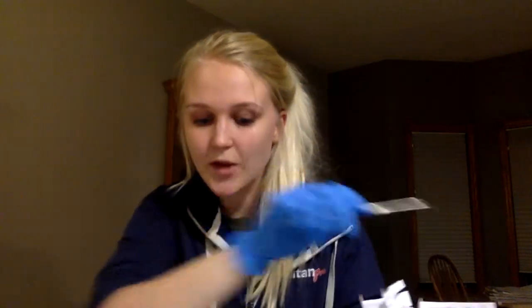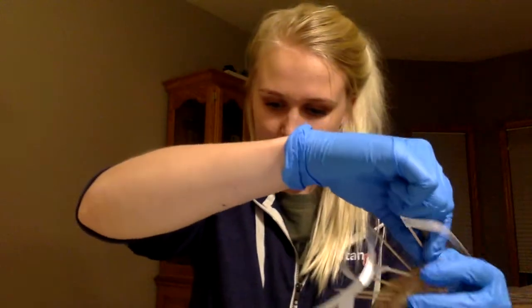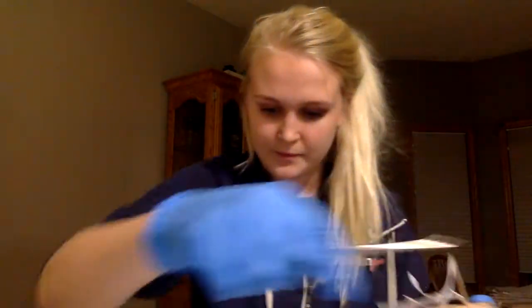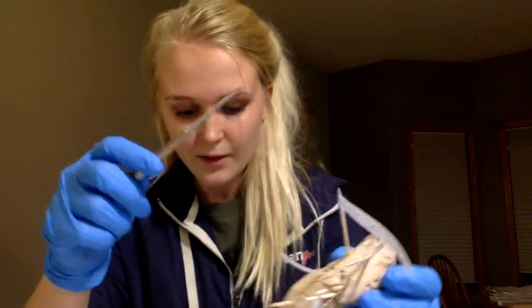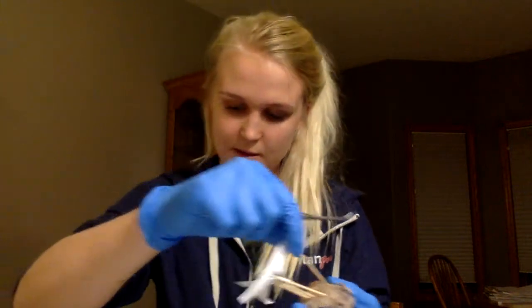The olfactory bulb was kind of another difficult one to identify, but this contains cell bodies of neurons that synapse with neurons of the olfactory nerves. I believe I placed that one up along here. This X-shaped structure results from the right and left optic nerves crossing over each other and is known as the optic chiasma.